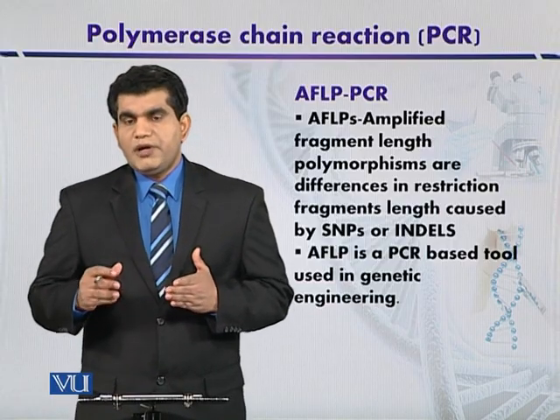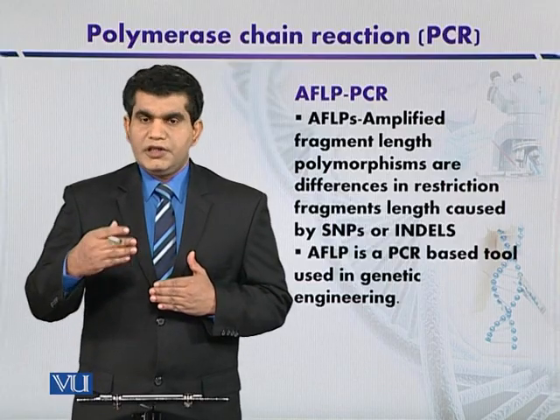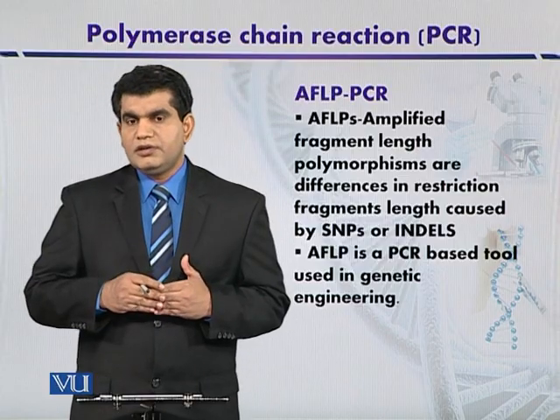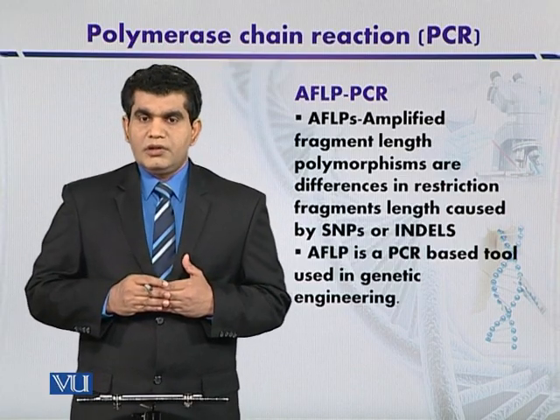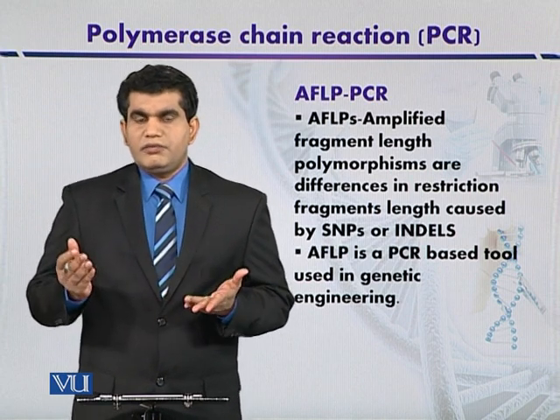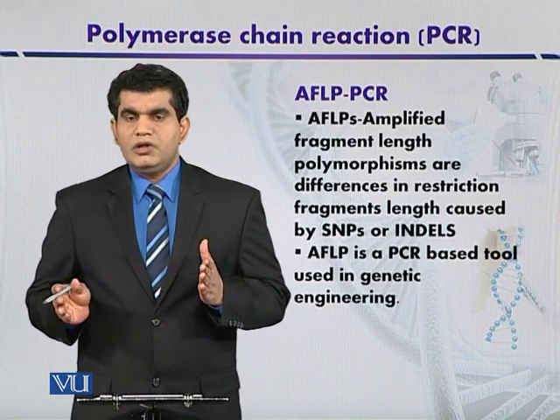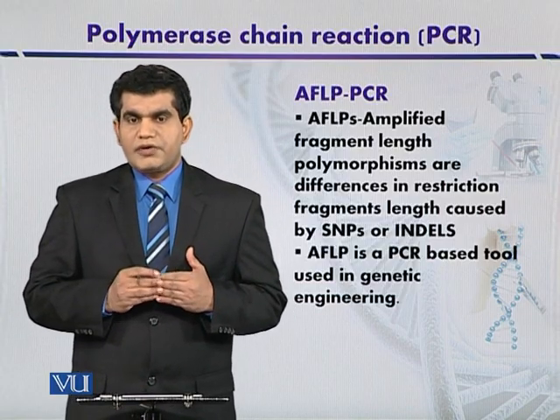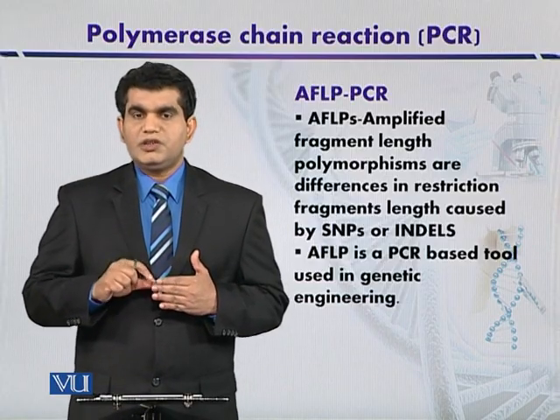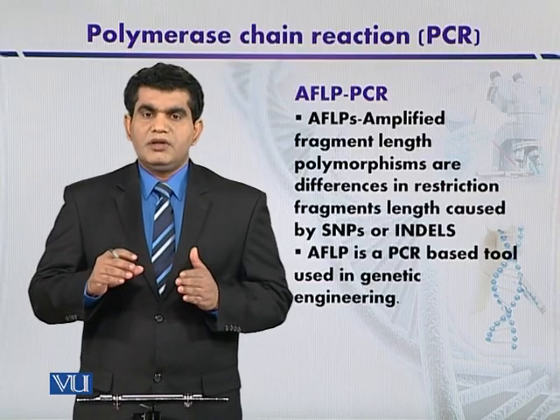Now if you remember, previously we studied the difference between adapters and the linker molecules, कि like adapter है तो उसके sticky end होंगे, एक end blunt होगा, and in case of linkers both ends are blunt, but they have the ability to ligate within the DNA fragments. Like adapters, they also have one end sticky, so it can bind with the sticky end DNA fragments after its digestion.